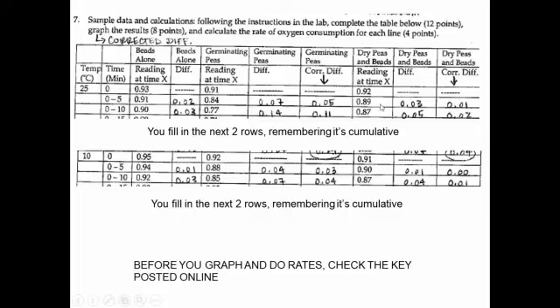Okay, and we would do the same thing for our other vial, which is dry peas and beads. So this has had a change of 0.03, but again, we have to subtract our 0.02, and so we end up with a corrected difference of 0.01. Our corrected difference numbers are going to be the ones that we graph.